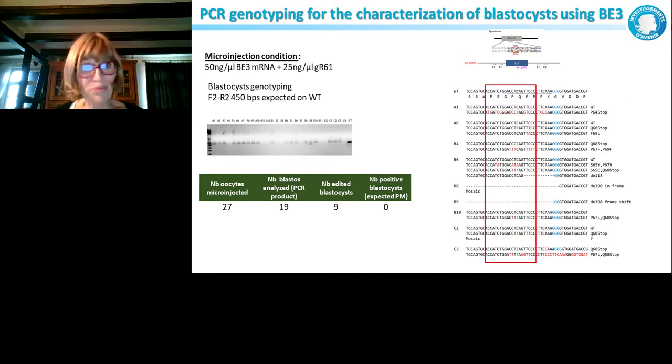And what is more annoying is that, again, the animals are really very mosaic. We see many alleles, 2 to 3, which is not better than what we obtain with a single donor DNA, in which we can really only introduce the mutation we want and select for it.